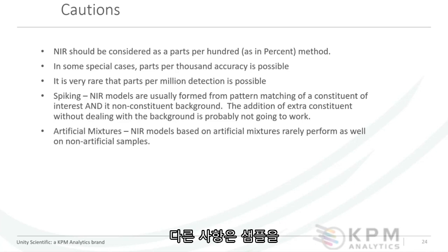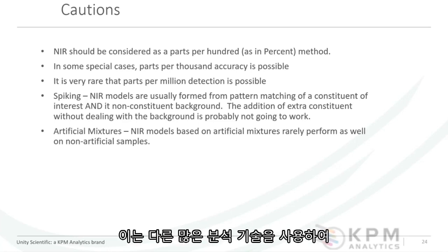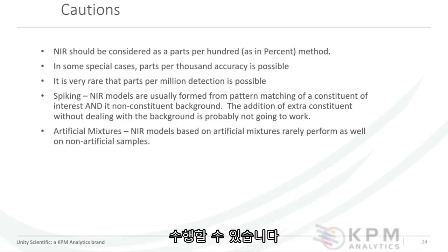Another thing to think about is spiking, or artificially mixing samples. This can be done with a lot of other analytical techniques, but in general, it does not work with near-infrared.